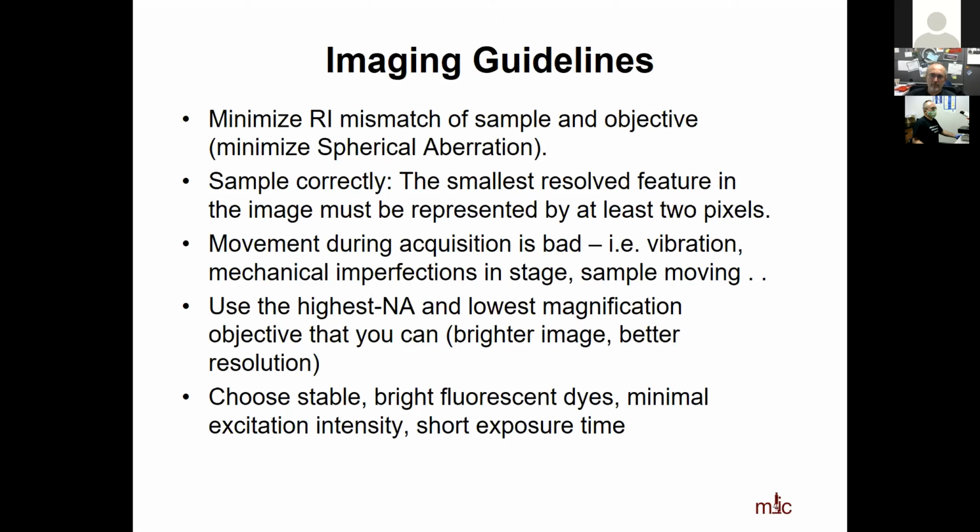So if you have a live sample that's mostly buffer or water, you should use a water immersion objective. Or if you have a fixed sample mounted in some high index medium, oil immersion is probably going to be reasonably good.